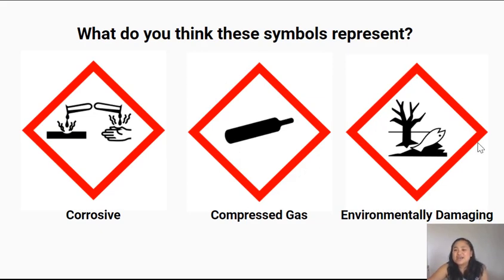In this picture there's a tree without leaves and a fish that's upside down. An upside-down fish looks dead, and a tree with no leaves looks dead too. This symbol represents that something can be environmentally damaging. So we don't put environmentally damaging things down the drain or in the garden — we dispose of them appropriately.